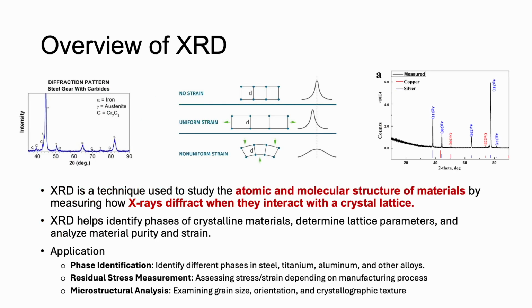Okay, let's get started with X-ray diffraction. It is a powerful analytical technique that allows us to study the atomic and molecular structure of crystalline materials. In essence, when a beam of X-rays interacts with the crystal lattice, the X-rays are diffracted by the regularly spaced atomic planes. And these diffraction patterns reveal the structures, identify the phases present, and can even indicate impurities or strains in the materials.